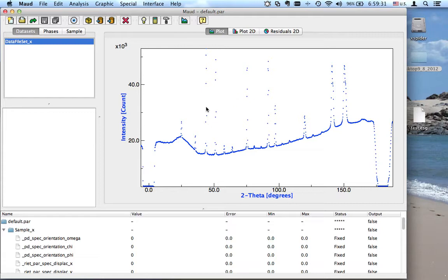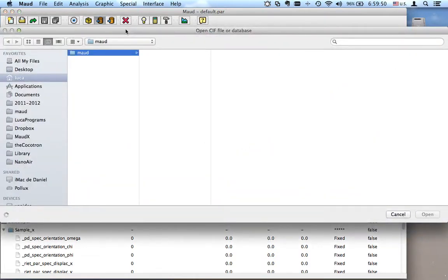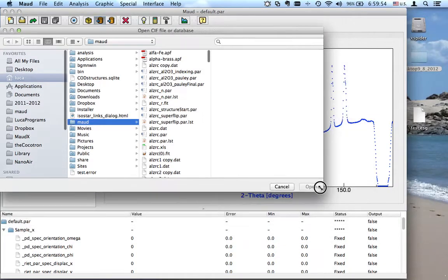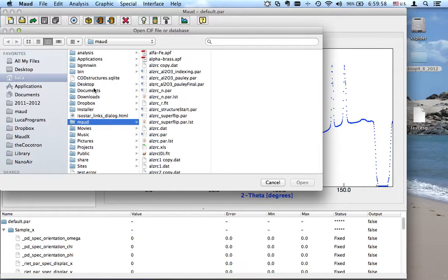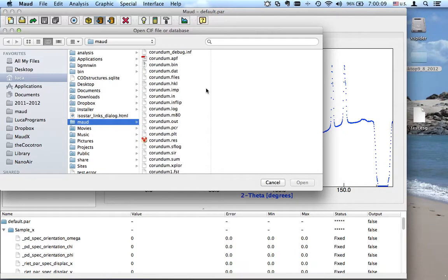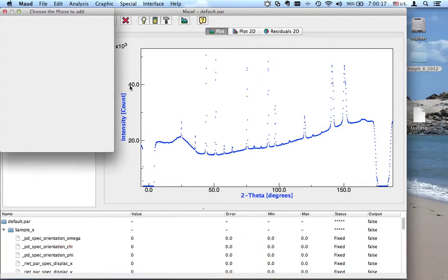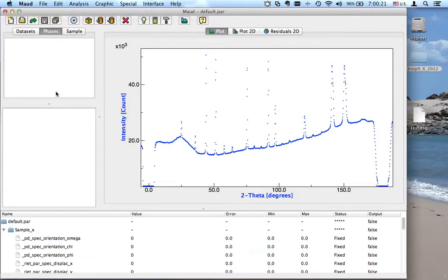Here is our pattern integrated. We can just work with it. The phase here is nickel-three-aluminum. I will load it using a CIF. I don't remember where I put the CIF, but I can use a parameter file in which these are in CIF format. I can load that file from there — I have one here too. Inside film one dot par — there is one nickel-three-aluminum. Choose. OK.